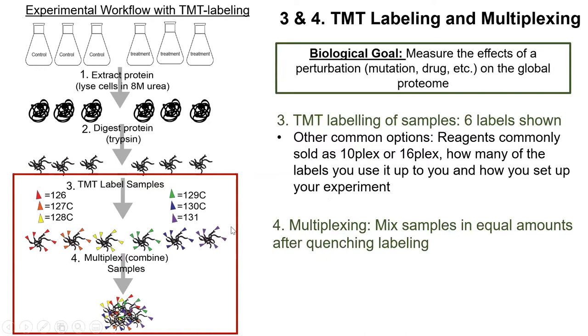And then after you label, you're able to multiplex, which is a fancy way of saying mix all your samples together in equal amounts. So in the next couple slides, I'll go into a little bit more detail about what these TMT labels are, just to help with any details that haven't sunk in yet.